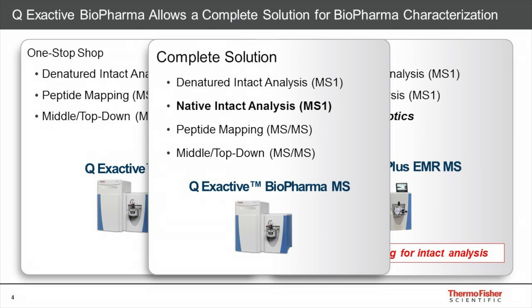Most of the technology is identical. It's also lent itself well to middle and top down. This is looking at medium to smaller proteins where we're actually doing MS/MS and we're understanding these incredibly complex fragment patterns. So the Q Exactive can do denatured intact analysis.